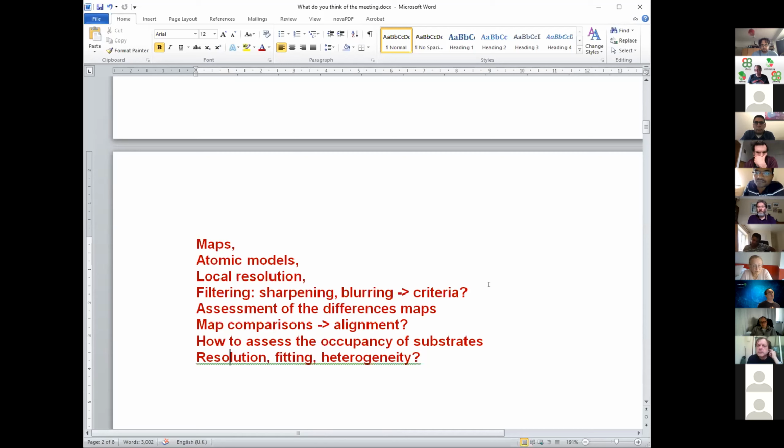It might be origin and might be slight rotation, that is, whether the coordinate system of the PDB file corresponds to the coordinate system of the EM map. Rotation requires a little bit more time, but origin correction takes a fraction of a second, I think.